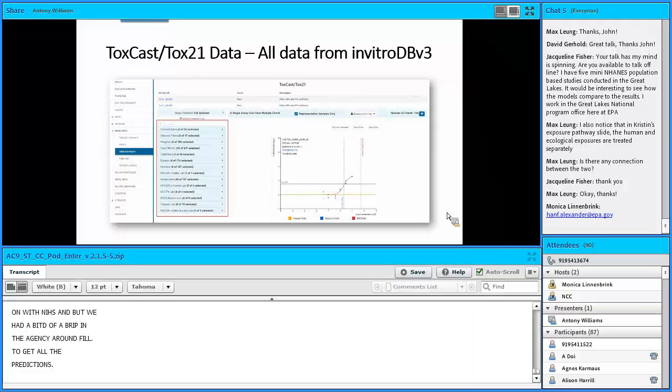what you can see is when I've selected active at the top of the red box, all I want to do is display the bioactivity curves associated with all assays that have active hit calls. So by selecting that, out of the CTOX list, 2 of the 24 selected, 24 assays in total from this vendor, 2 of them have active hit calls. Selecting the accordion itself will open up that entire list.